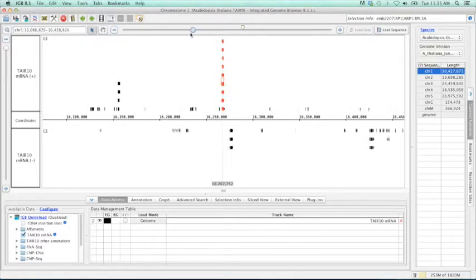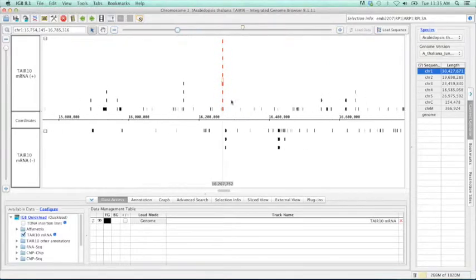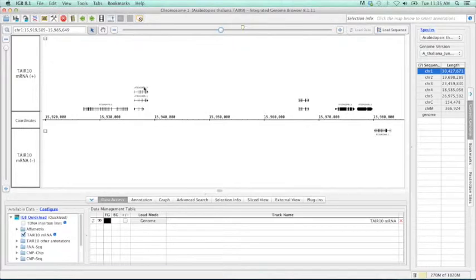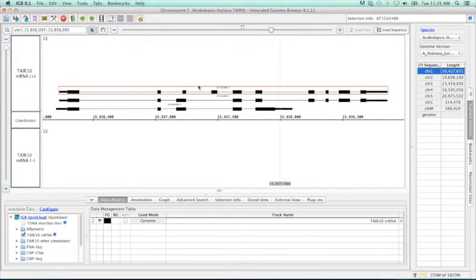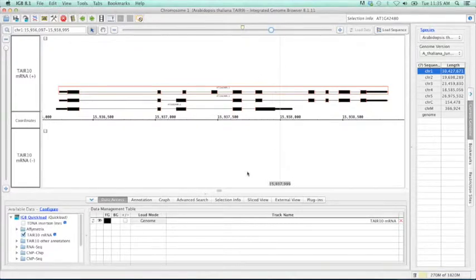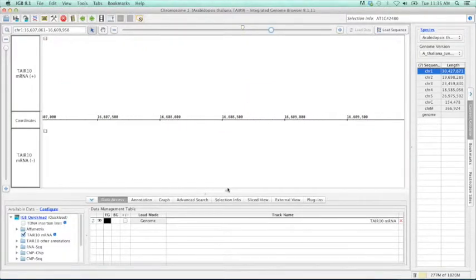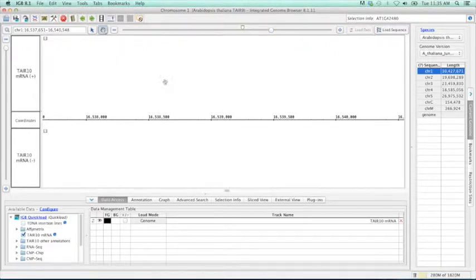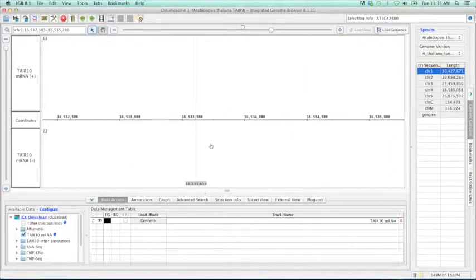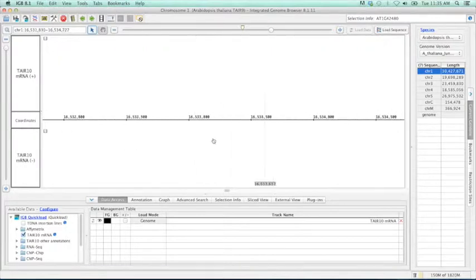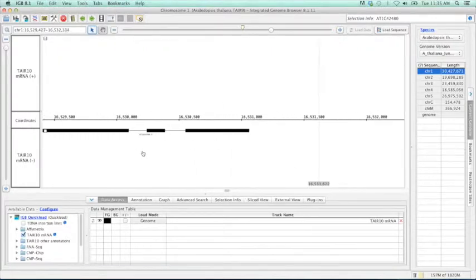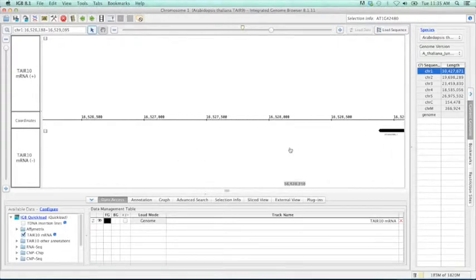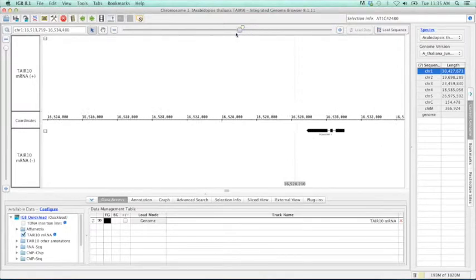Similarly, we can just use the plus or minus buttons to zoom in on this region. In addition, if there's a region you're interested in, you can simply drag along the coordinates axis to highlight this region and zoom in to that region. Or, if a particular gene model is interesting, you can simply double-click on it to zoom in on that gene model. For moving horizontally, we can use this slider at the bottom of this viewer. This will move us along at a relatively quick pace. In addition, you can also switch to the grab tool and simply drag yourself along.